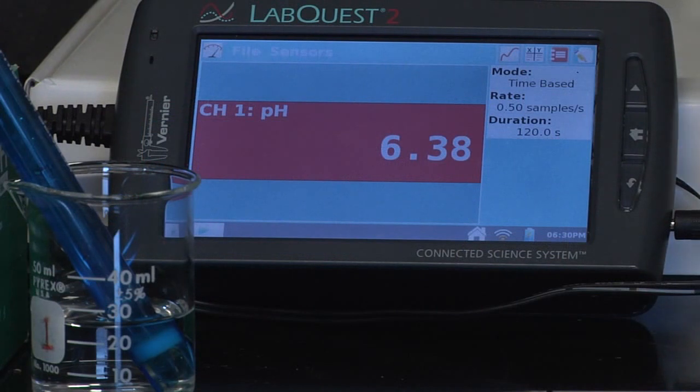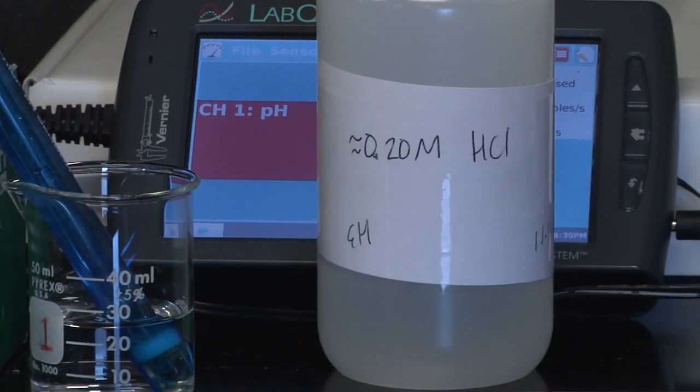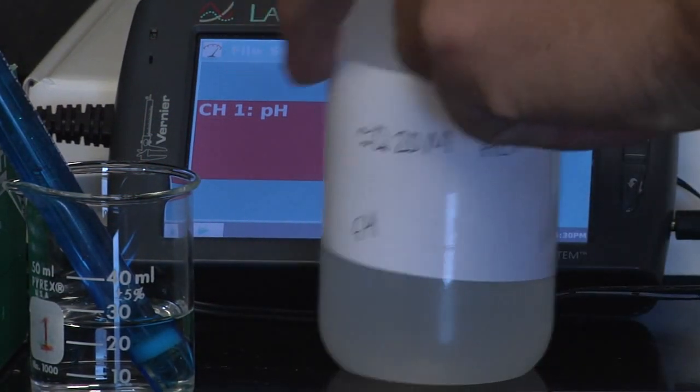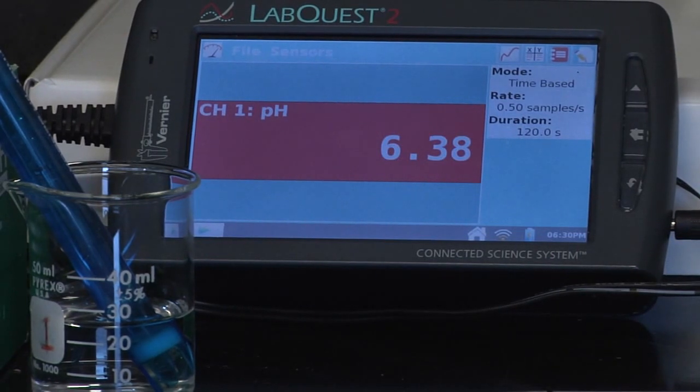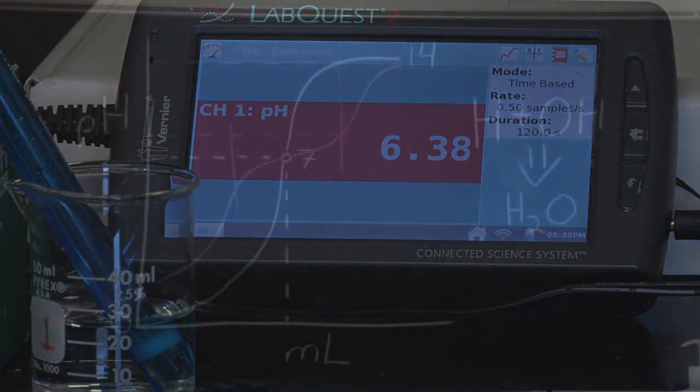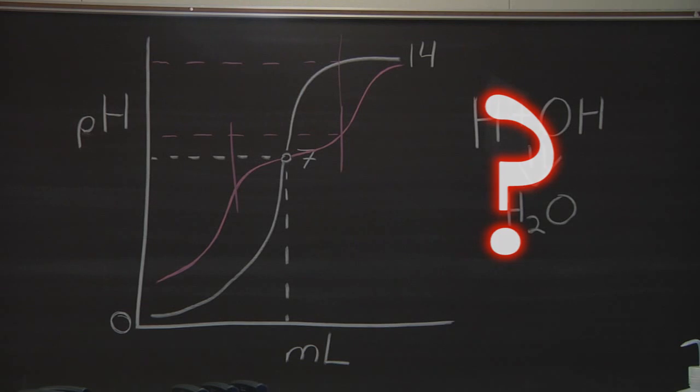So now we're going to take our 0.2 molar hydrochloric acid and add a couple drops of it to our solution. Now what do we expect to happen according to our graph?